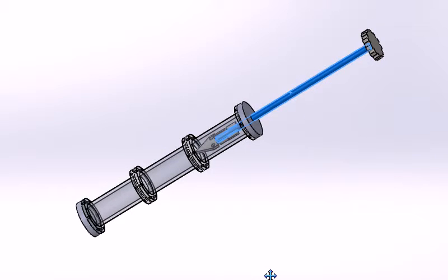These could be put in a circle around the actual motor that's driving it. So the motor would drive ten of these at the same time with exactly the same timing.